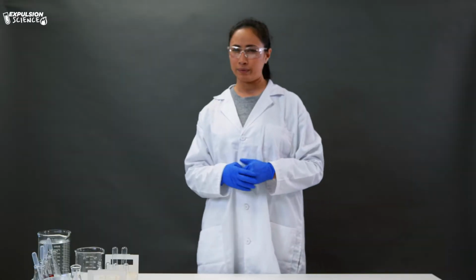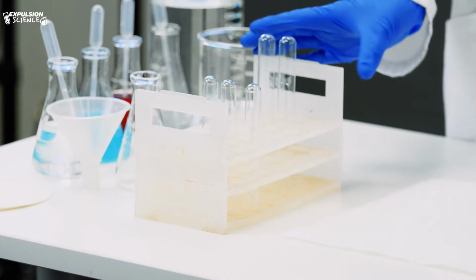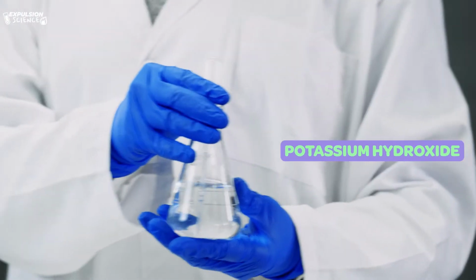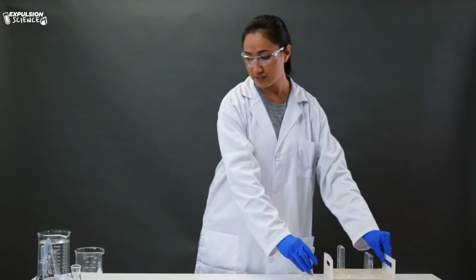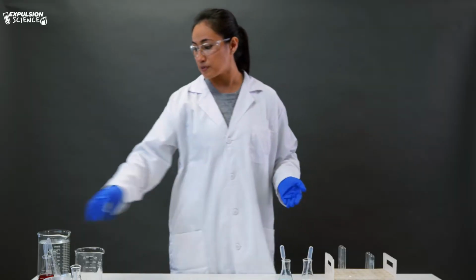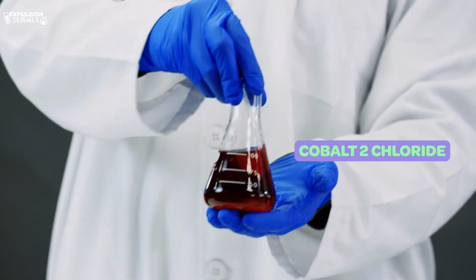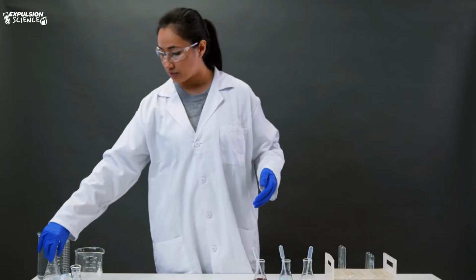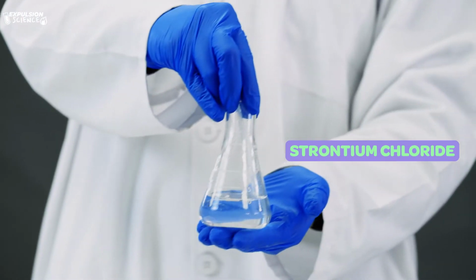For this experiment, we're going to be using the following materials. We have a test tube rack that will be holding our test tubes. Our first substance is going to be potassium hydroxide, which is a colorless looking liquid. The second substance we'll be using is copper 2 chloride. Our next substance is cobalt 2 chloride, which has that red color. And then lastly, we're going to be using strontium chloride, which is a colorless liquid.